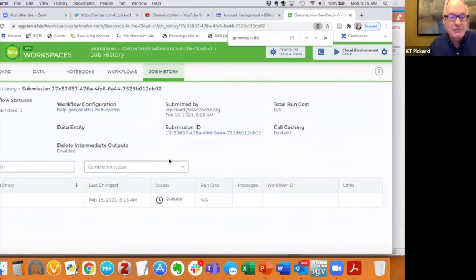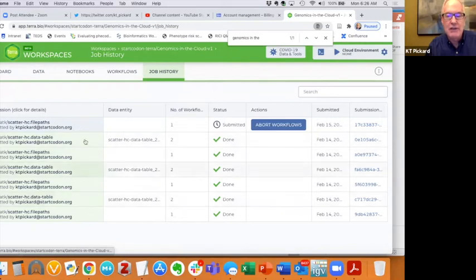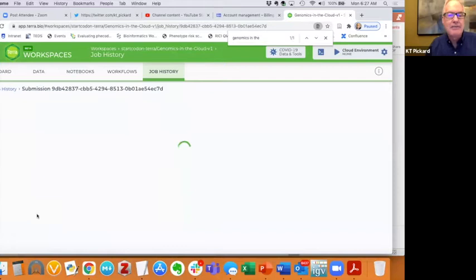We're off and running. I'm going to go into the job history for this workspace and show you. I've done this a number of times. There's the latest one that I just submitted, and it's going to be running in just a moment. But let's go into previous ones. The first one, for example, I ran here. It's tempting to click on the submission ID. It's actually a lot more helpful to click on the submission itself. So you click on that.